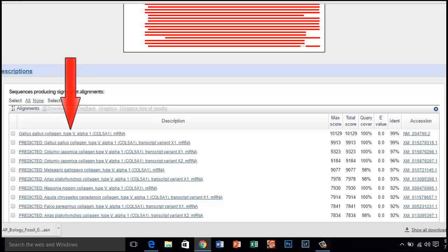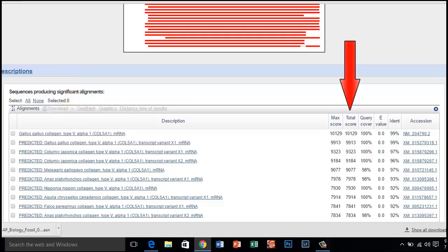This is the species and gene name that matches the gene of interest. The score refers to how many gaps or substitutions are associated with the sequence.